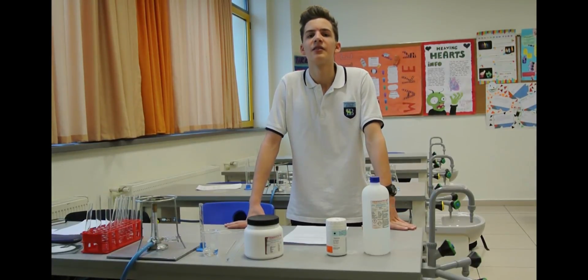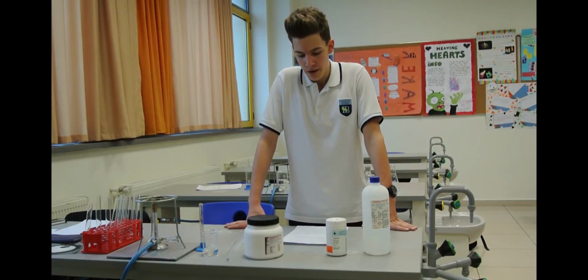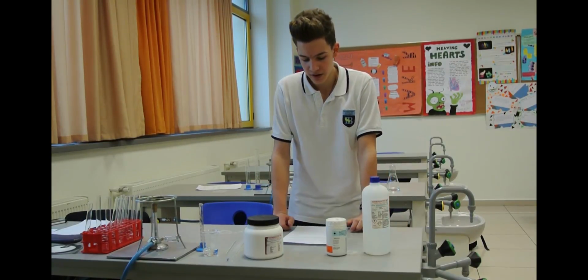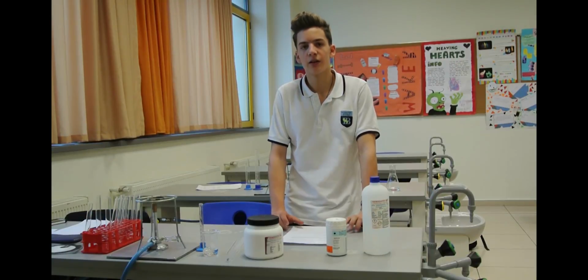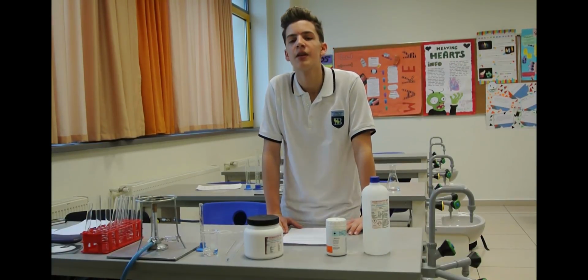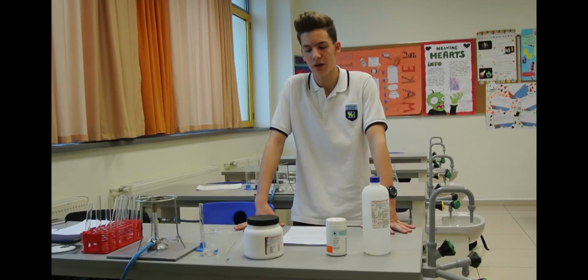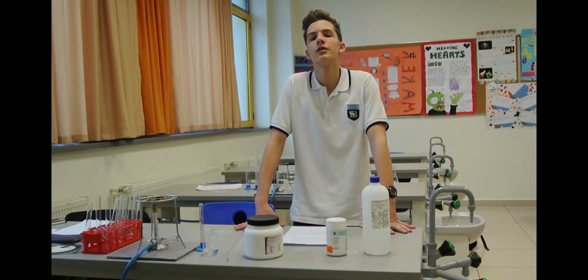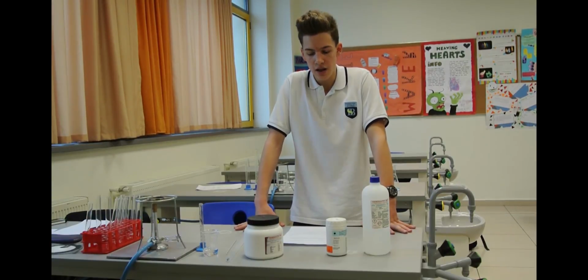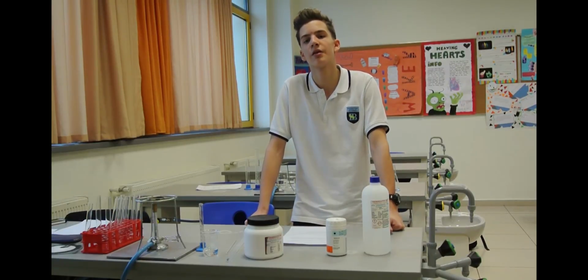I'm a student in the International School of Bucharest and I take IGCSE Chemistry. My personal experiment is going to be the rate of reactions, and I'm going to see how a catalyst speeds up a reaction. The two chemicals I'll be combining are sodium potassium tartrate with hydrogen peroxide solution, and I'll see how fast the reaction will happen with and without the catalyst.